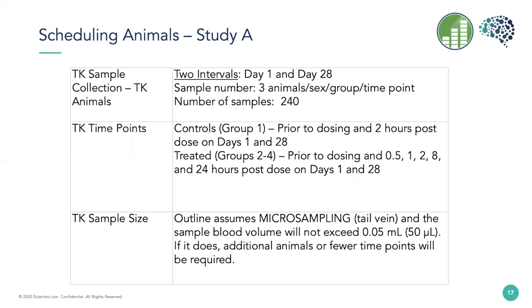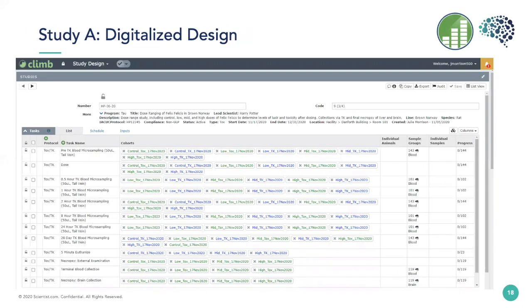But if you do this, you'll be bouncing between test material concentrations, and this is really a no-no. The result of this is that you're going to have gaps in your sample collection schedule no matter what. And figuring out when the samples need to be collected, in theory, based on how you plan to dose them, and what the gaps are going to be is actually a big headache. And you'll notice here that the controls don't even have the same time points as the other animals, which adds another layer of complexity.